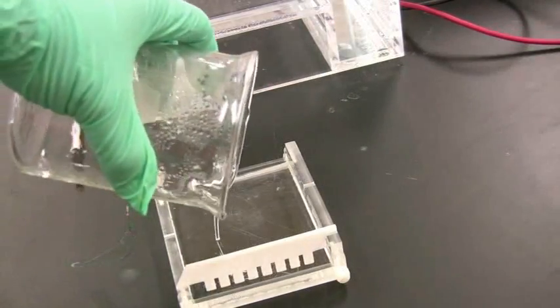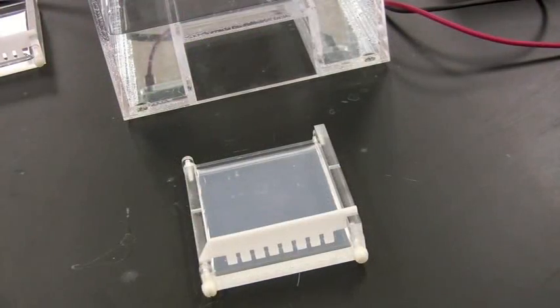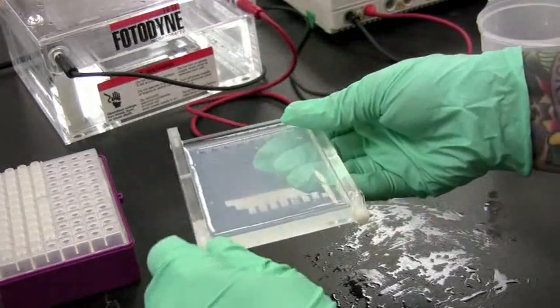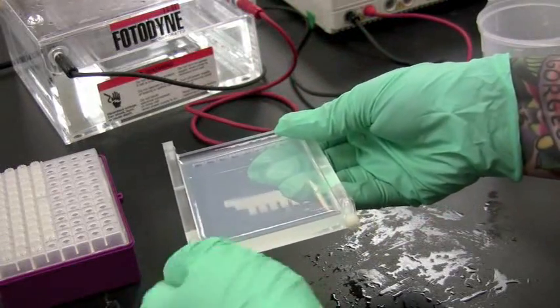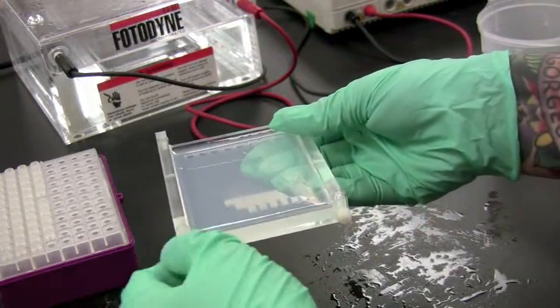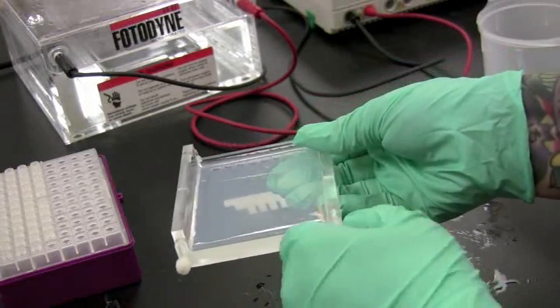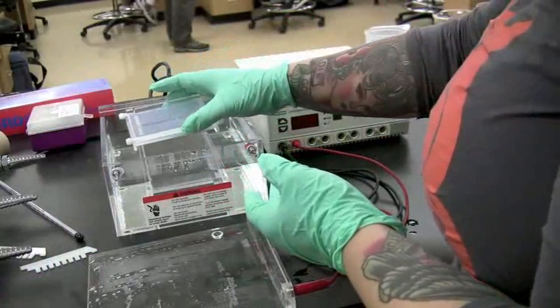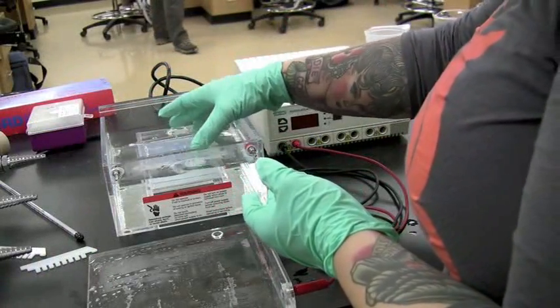When the gel appears foggy, it is ready to be placed in the chamber with the comb removed and the walls down. The wells should be on the side of the chamber with the black electrode, which indicates a negative charge. Pour 1X TAE over the gel, or place it in a chamber already loaded with 1X TAE.